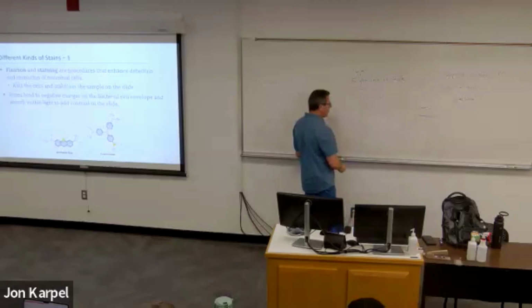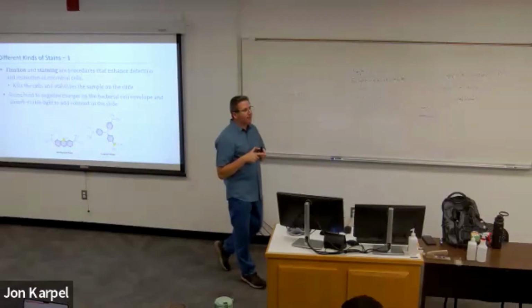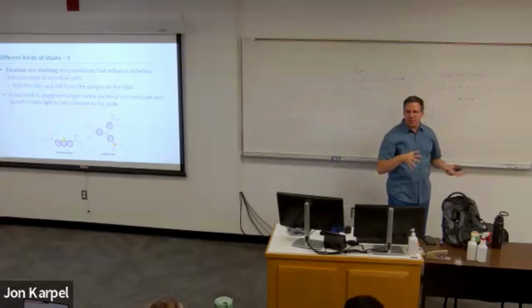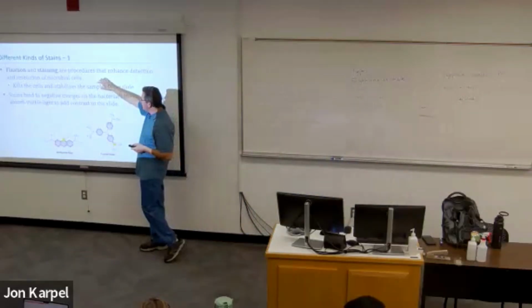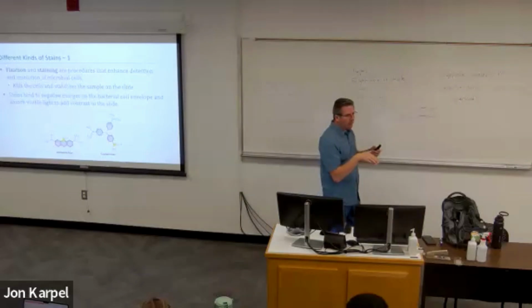So again, a version of a wet mount basically, except here, we're going to usually heat fix them first. So you don't just hold it over a flame, because then they'll just splatter all over the place. Okay, you'll learn this in lab. But you heat them a little bit first to fix them to the slide, and that usually kills them. And then you apply stains on top of that.